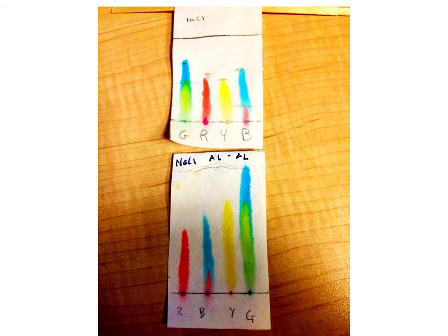The blue has some red in it as well as the blue dye. Even the red itself is actually a mixture of red 3 and red 40. Yellow generally pretty much is pure, though in the bottom strip you can see a little bit of probably some contamination of red from the manufacturing process.